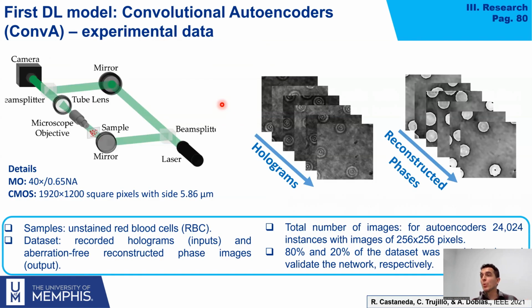Why not try with a real data set? So we trained the algorithm using samples of unstained red blood cells.